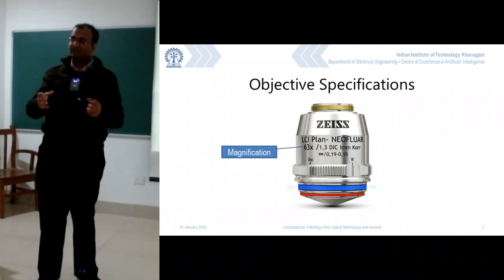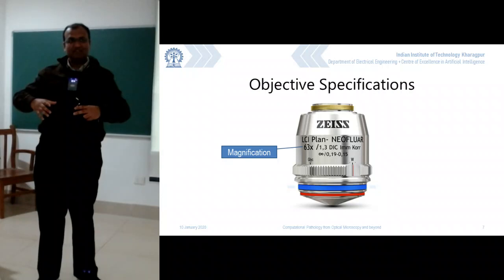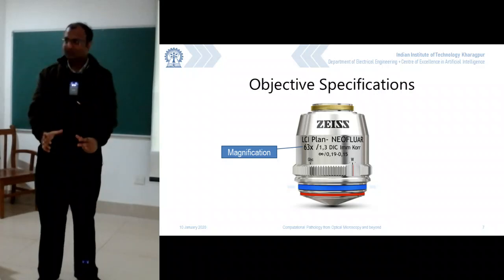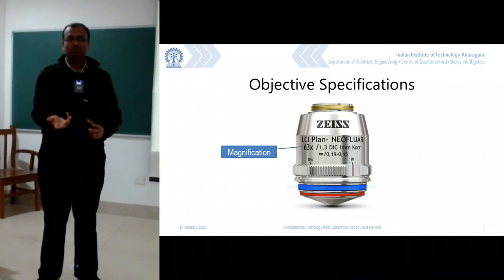As a result, what we can do is, in some way, not let the refractive index change. The only way of not changing the refractive index of the lens would be by making the lens go up to the level of the slide itself, or fit on top of the object. Now imagine you put some cell, are you going to put molten glass on top of it? That's the only way. Glass's refractive index is glass's refractive index, but you are not able to do that.